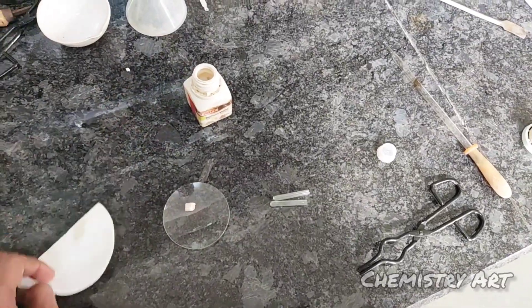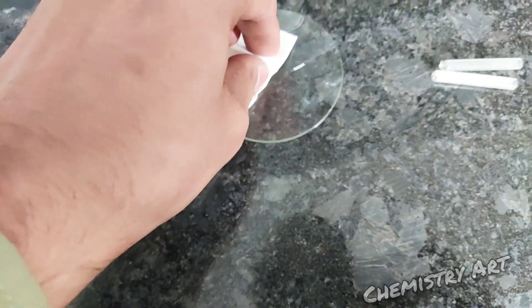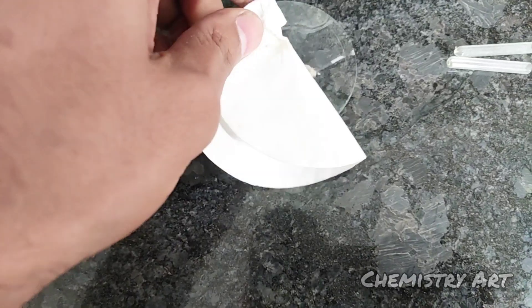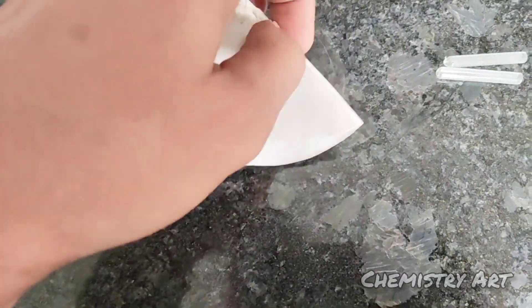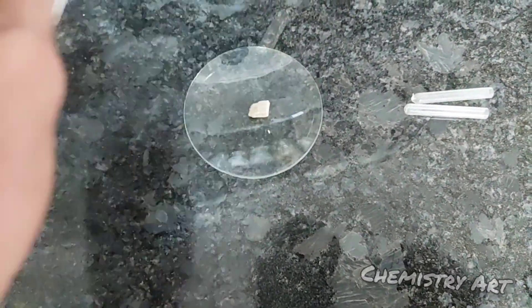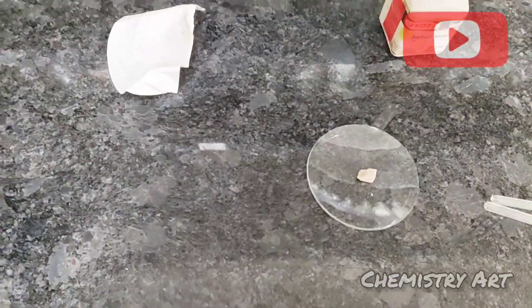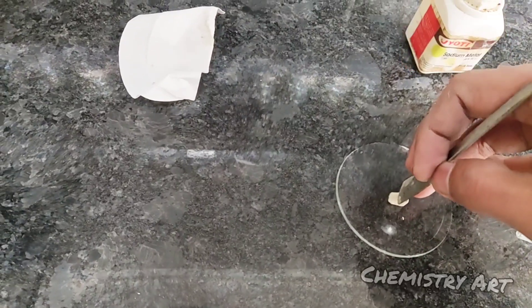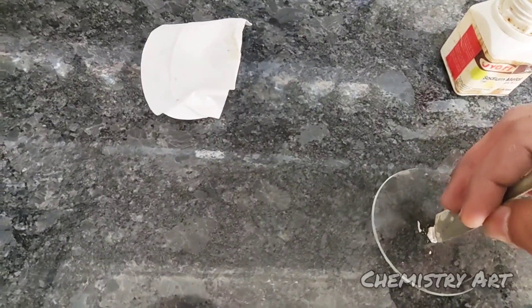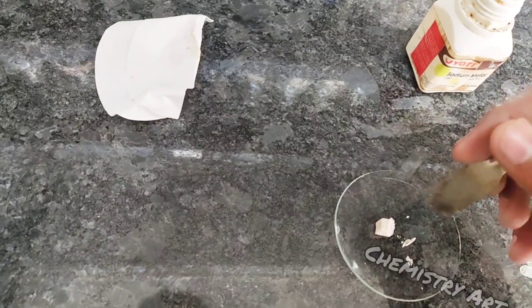I have taken a small piece of sodium metal and with the help of a filter paper, I am soaking the kerosene off this sodium metal, because sodium is kept in kerosene as it is very reactive. Sometimes paraffin oil is used. We need to make it dry and then cut a very small piece of sodium — about the same size as a grain of rice.